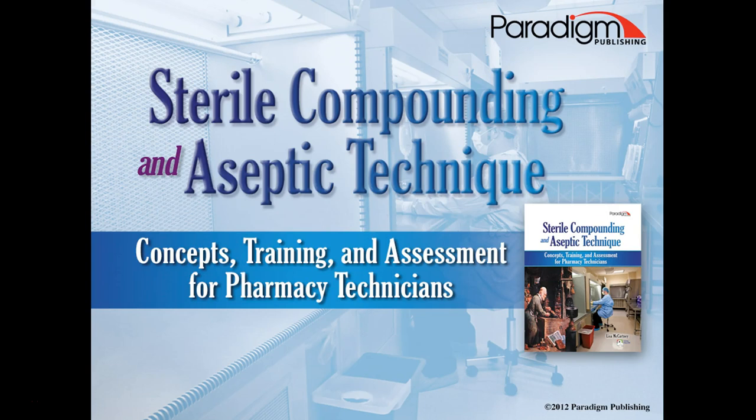PHAR 110. This is the start of Unit 2 in the textbook, which takes the theory from chapters 1 through 5 and introduces the student to techniques and competencies for preparing sterile compounds. The laboratory component will be hands-on practice of the theory in chapters 6 through 14. Please be sure you have read Unit 2 Compounding Sterile Preparation pages 157 through 163 for some background.